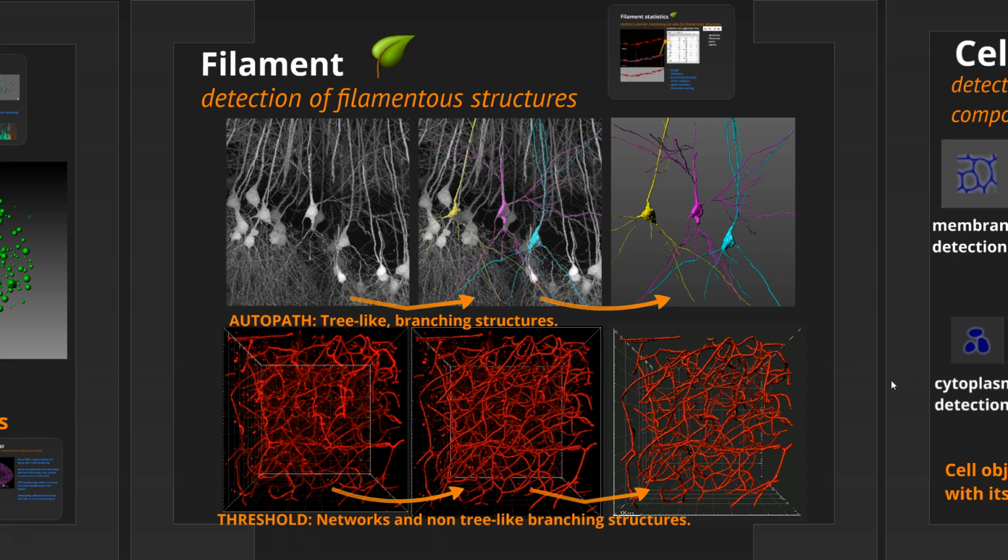So incidentally, this data set up here, this is just a small portion of it, was a 20 gig expansion microscopy data set. And each of these neurons were actually traced independently. We've also optimized our semi-automatic tracing tools to work with big data. So that's something that I'll be showing at the very last session today, some of the new tools for that.